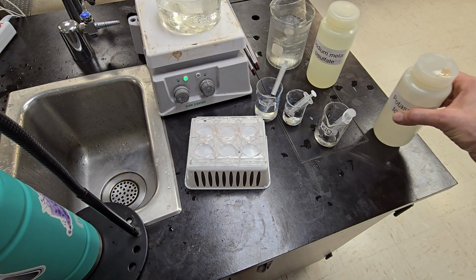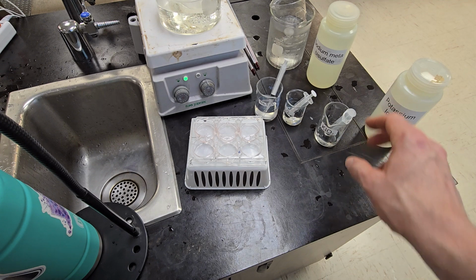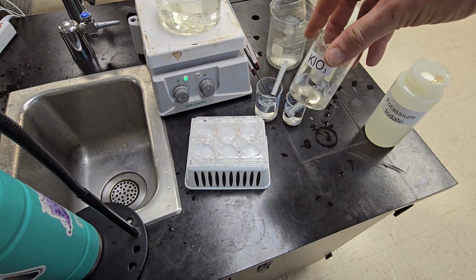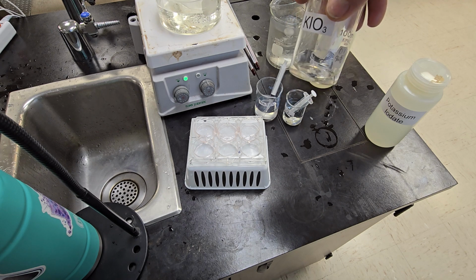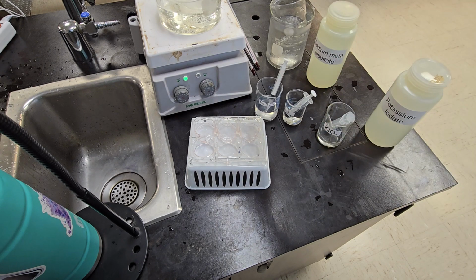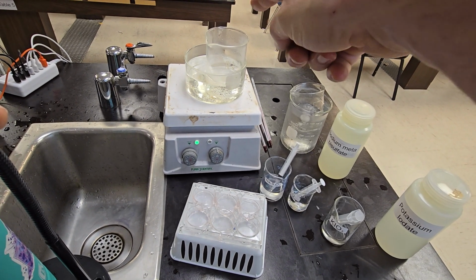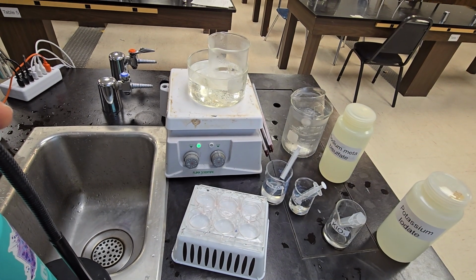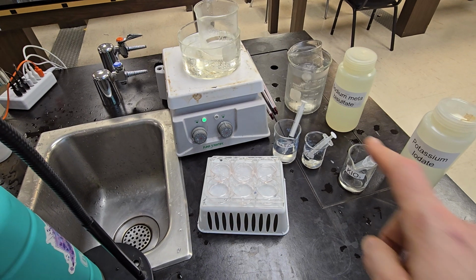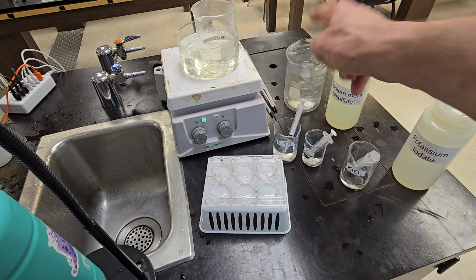I'm going to tell you these temperatures right now. You'll have to write them down. If you miss them, you're going to have to go back in the video. Our room temperature potassium iodate is 24 degrees. I've already measured these. They're 24 degrees. Our heated potassium iodate, that's up here on our hot plate, is 71 degrees. That is our hot potassium iodate. Our cold potassium iodate here is 9 degrees.